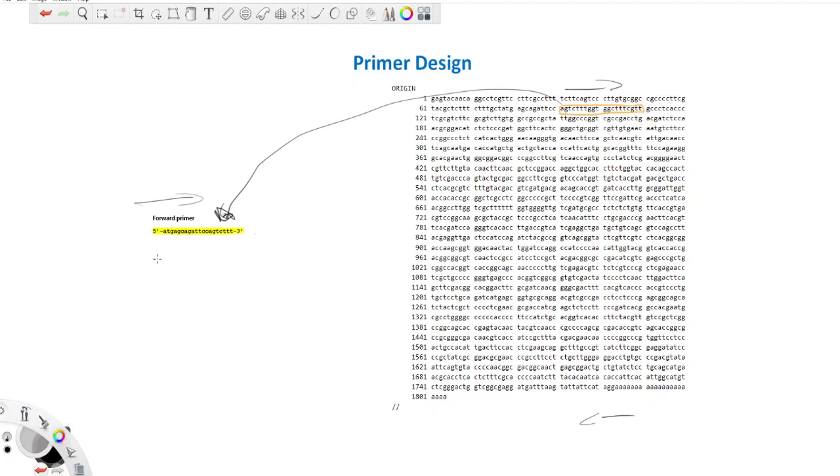So what we have here, I'm going to rewrite my forward first, which is now T, A, C, T, G, C, T, G, T, A, A, G, G, and we have T, C, T, and you continue. I think hopefully you get the picture here.